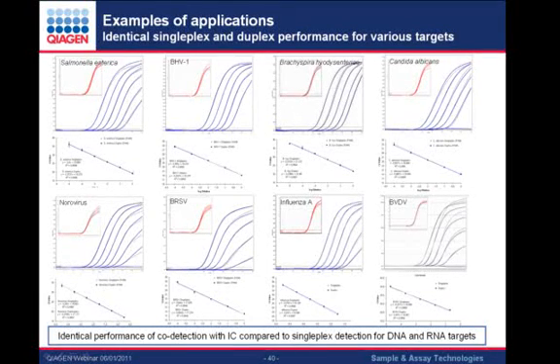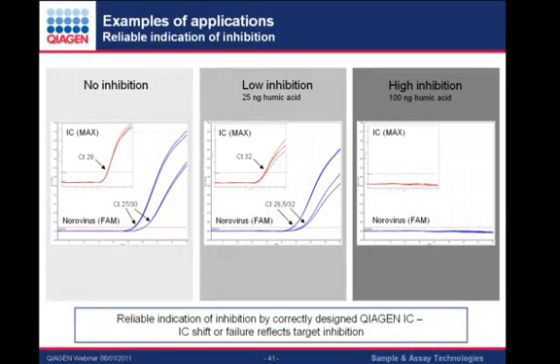Maybe I would like to mention this special case here, this BRSV, bovine respiratory syncytial virus assay, is always a nice example. It's an assay with a primer probe system that was chosen randomly from literature. And it has a very low efficiency and is generally not a very nicely performing assay. The slope is something like minus 3.65 or something. It has low efficiency, but surprisingly, even the performance of this deficient assay was not impaired by duplexing with the internal control, as you can see here, showing again that the internal control system is designed and set up to be absolutely non-competitive.